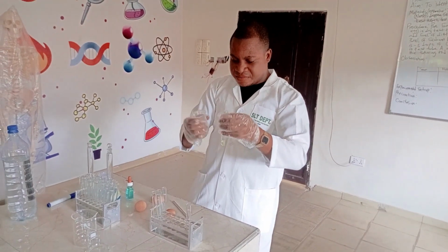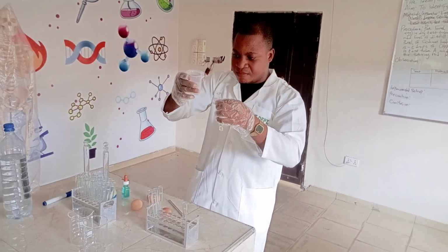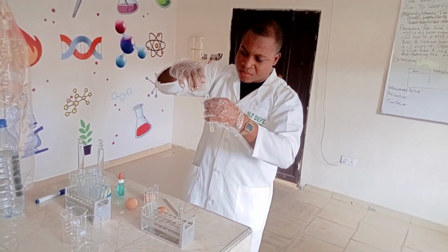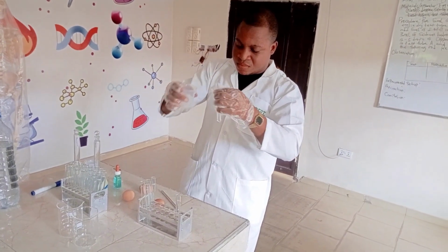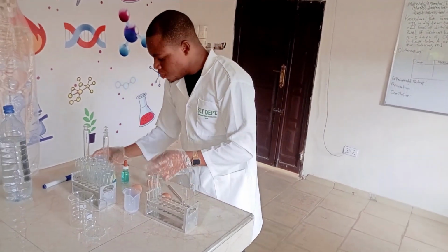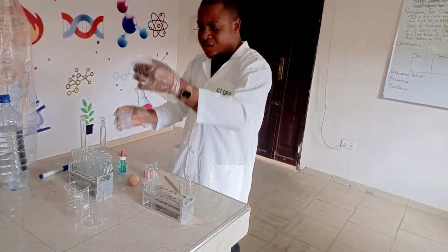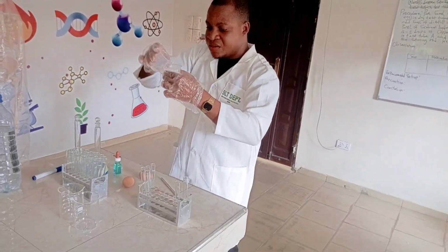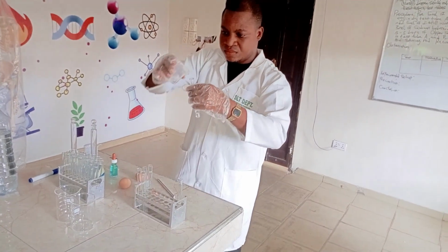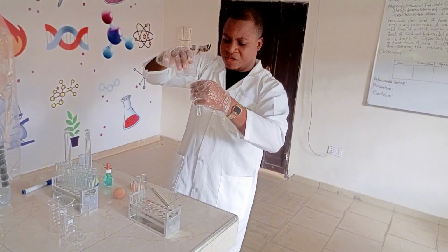I'll introduce it here, into test tube A with the egg white. I will also introduce 3 ml inside the water also.